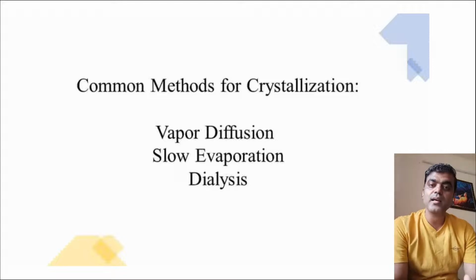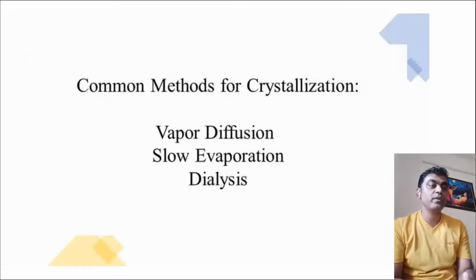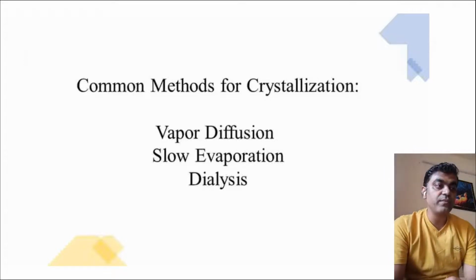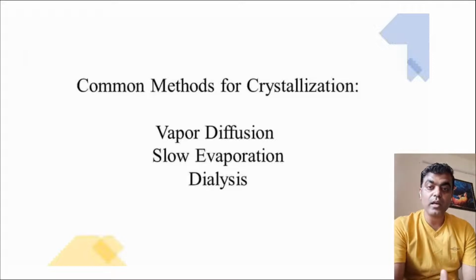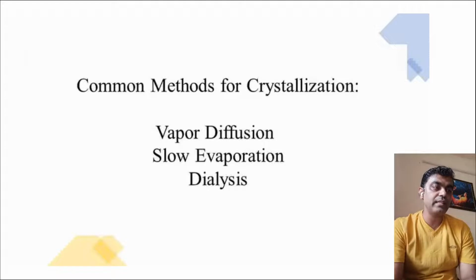Now these are the do's and don'ts before you start your experiment or when you plan your experiment. But the thing is, what are the methods? We should also understand how you can form crystals. So grossly there are three which I will be discussing today.